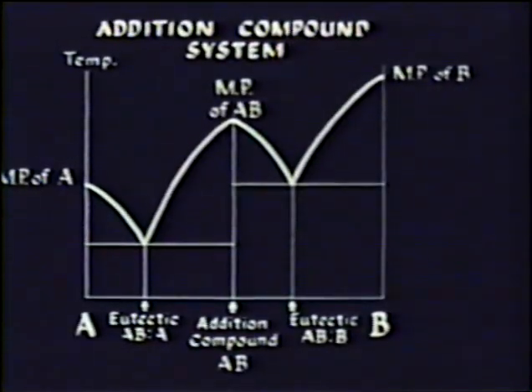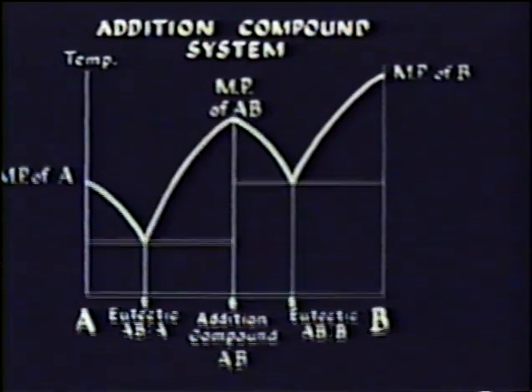This composition diagram shows the melting points of various mixtures in a system showing addition compound formation. TNT and 1-mononitronaphthalene will be used to illustrate this type of system. TNT grows from the right, and after digestion in the zone of mixing shows characteristic profile angles. These angles are best shown in another field of the same preparation. The addition compound next grows rapidly through the zone of mixing along the TNT crystal front.